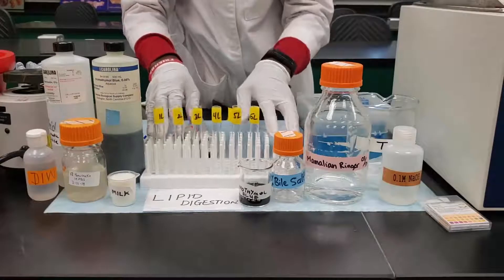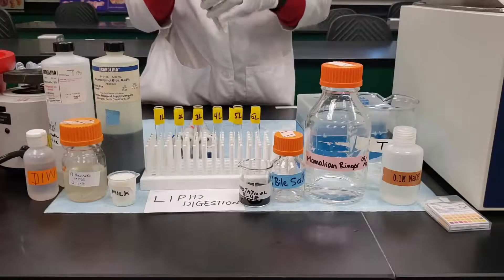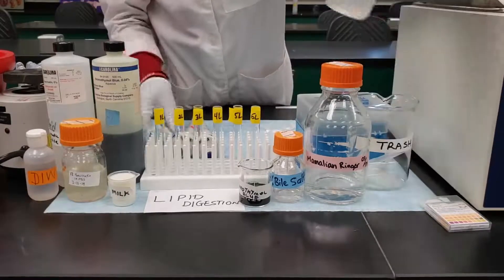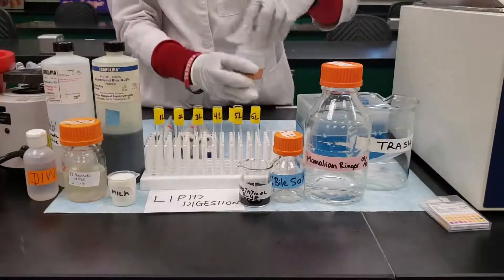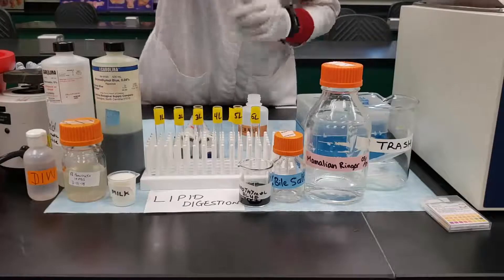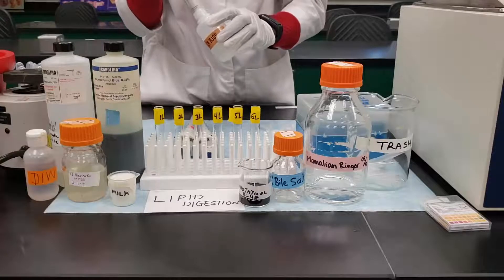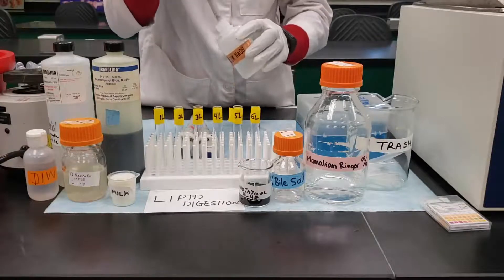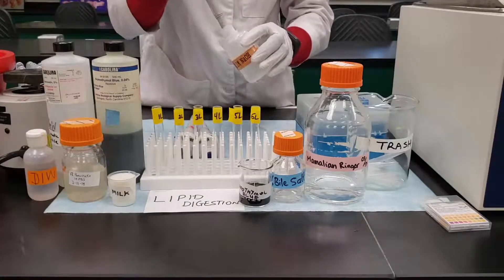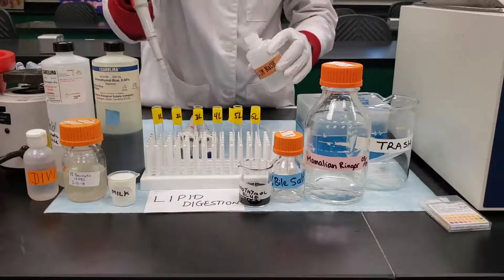To start this experiment we need to add 0.2 mL of 0.1 normal sodium hydroxide to each of the test tubes. Sodium hydroxide is an alkaline solution and it's used to regulate the pH of our solution. Remember, fat digestion is based on changes in pH — when fats are hydrolyzed they become acidic and form fatty acids and glycerol.